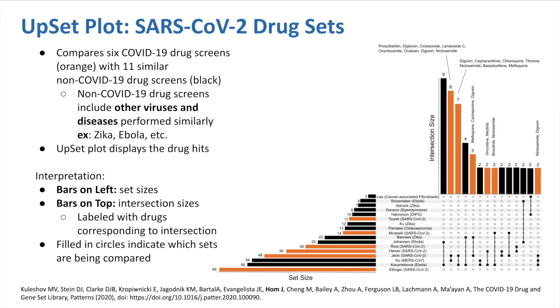Now that we know how to use the Aperture, we can look at a few examples in which the Aperture can be applied to the study of SARS-CoV-2. Here we have an upset plot that I generated, which is part of the COVID-19 Drug and Gene Set Library paper created by the lab that was published in Patterns. This figure compares COVID-19 drug screens with similar non-COVID-19 drug screens, including other viruses and diseases such as Zika, Ebola, and more. The bars on the left display the size of each set, the bars on the top display the size of each intersection, with the drugs corresponding to the intersection labeled above.